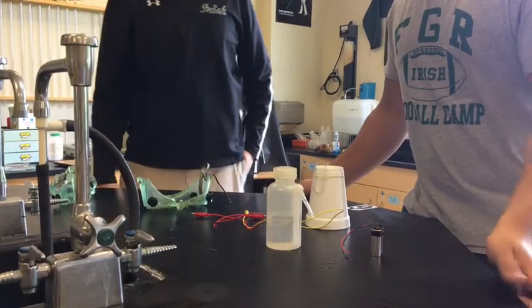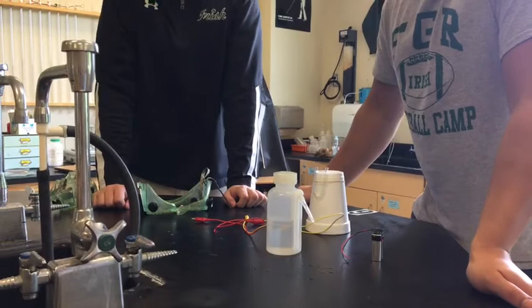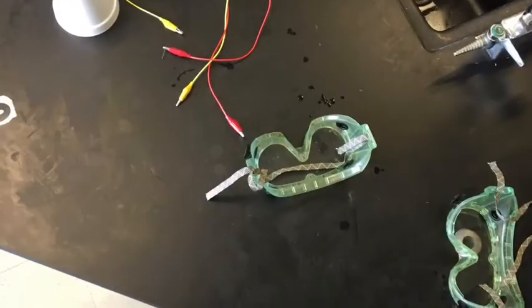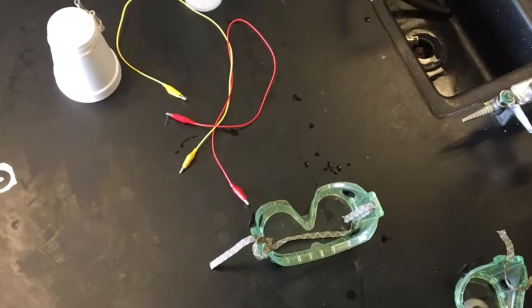It depends on which side you connect the battery. That is the electrolysis of water. You should also notice some gas bubbles forming on one side too.